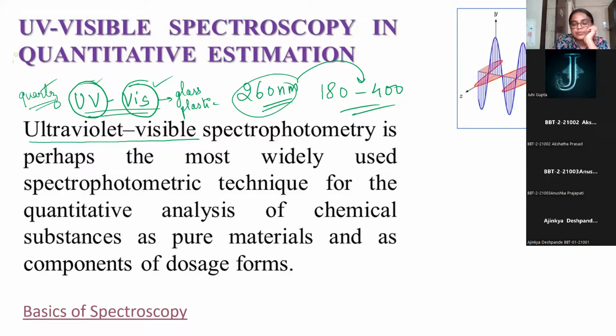Spectroscopy is extensively used to study the internal structure of matter, especially molecules of complex organic or inorganic compounds. Some of the major advantages of using spectroscopy over trivial methods of structural determination of complex compounds are: it is very less time consuming. The amount of sample required is very less. Although the setup cost of spectroscopy is high, it's very cost effective in the long run. Note that in both absorption and emission, the energy of electromagnetic radiation absorbed or released is equal to the difference between the energy of the excited and ground states.